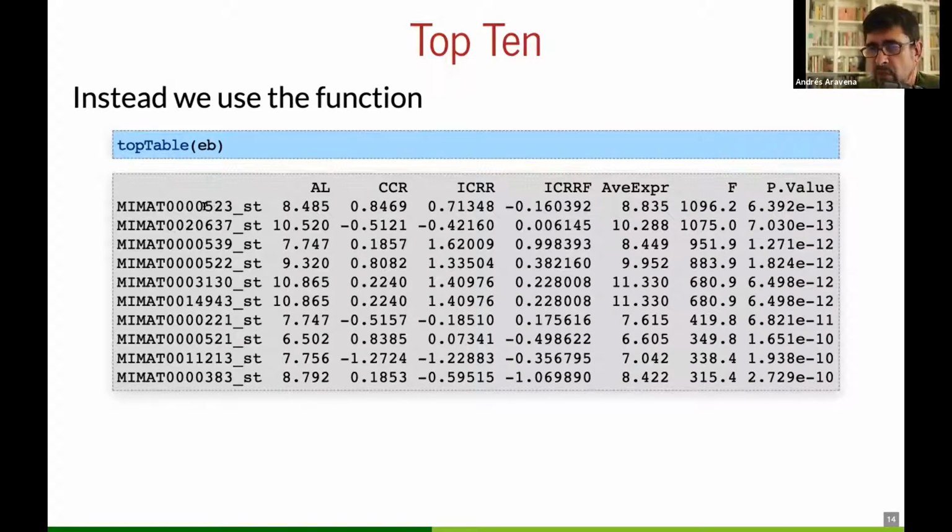And what we have here? Well, one row for every gene, one column for every condition. Remember the design matrix. The design matrix has ones in the first column. Therefore, what we get is the average expression for ad libitum. Like before, this is the average expression of ad libitum. And here we have caloric restriction versus ad libitum. This is the differential expression. Differential expression of intermittent versus ad libitum. I should have made this clearer, but imagine this is what we call a star design. We have ad libitum in the center, and then we have everything compared with ad libitum.